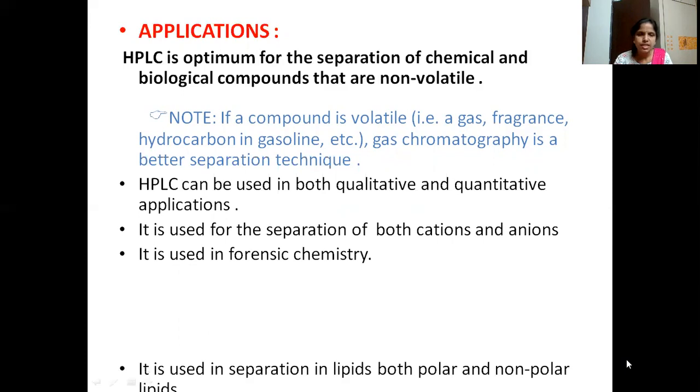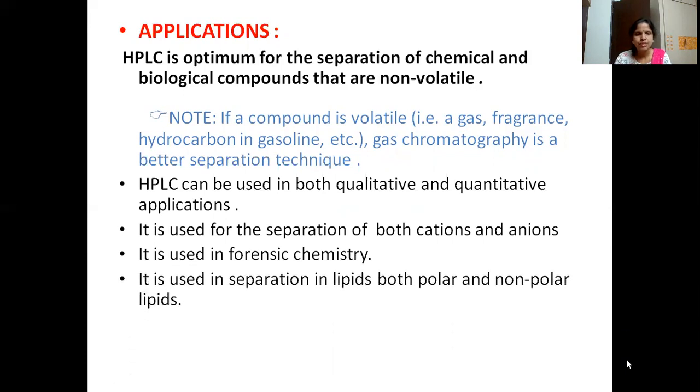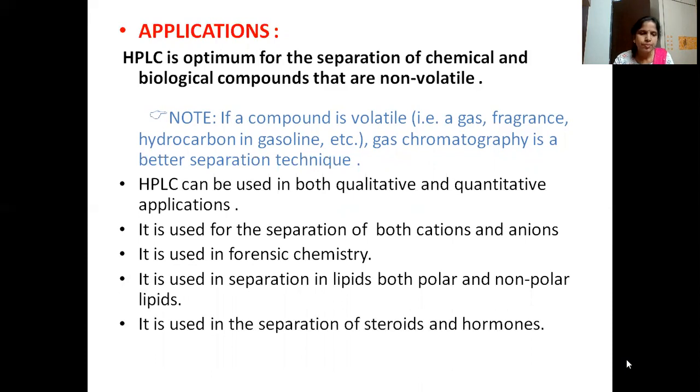It is used in forensic chemistry. It is used in separation of lipids, so both polar and non-polar lipids can be separated, as well as steroids and hormones. Large molecules can also be separated by using size exclusion HPLC.